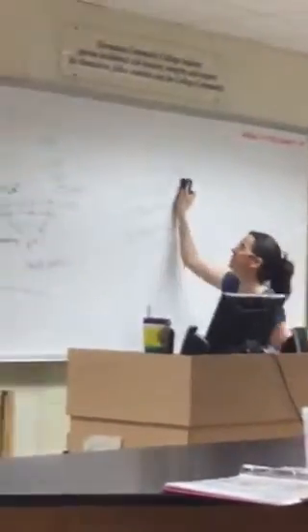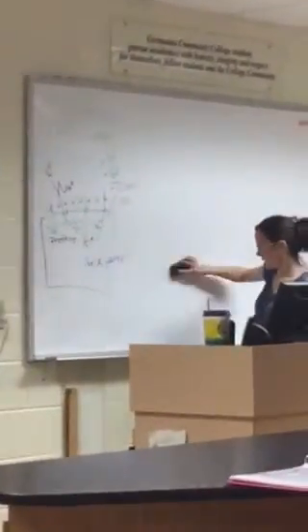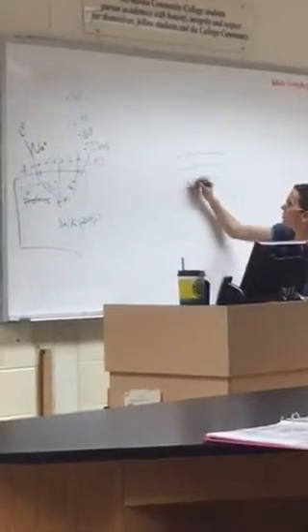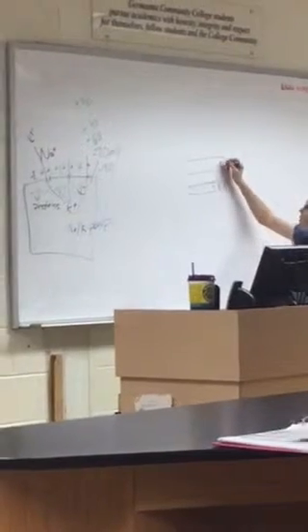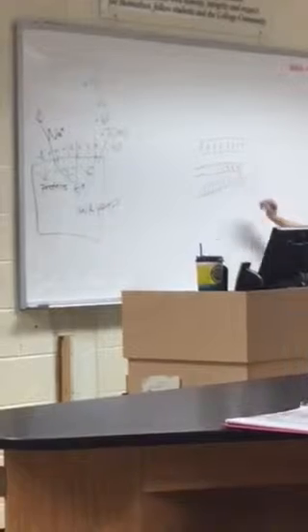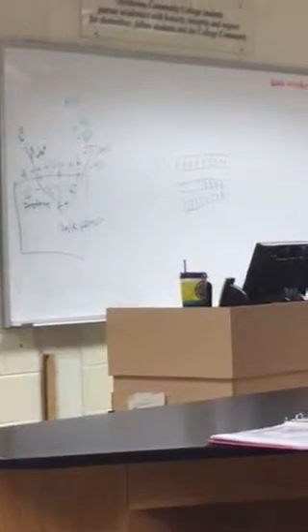So at the very end, and this is one of the slides that you'll look at, I think it looks kind of neat. All right, so you'll have some skeletal muscle fibers like this. So we see striation, so we know that's the skeletal muscle fiber.